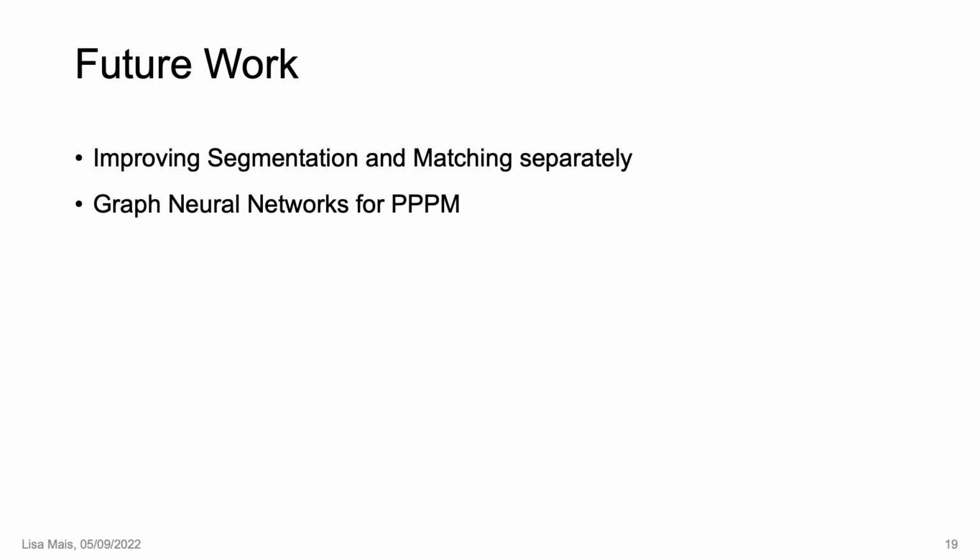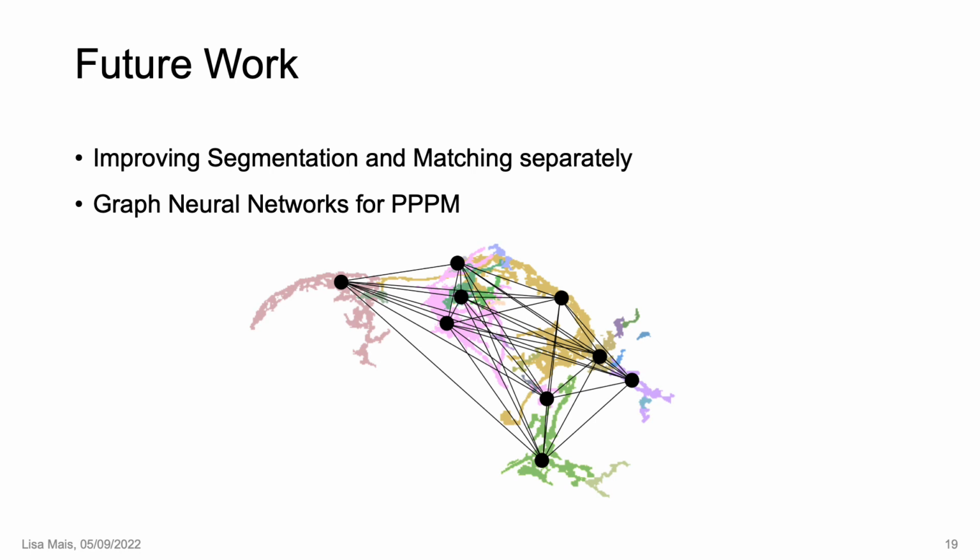In more detail, we want to use graph neural networks, where we construct a fully connected graph with the nodes representing the PatchPerPix fragments. And then we can use the NBLAST and coverage and color as node features, and as edge features we want to use the overlap, which means that different fragments may cover the same EM point, and this is represented in the overlap. And although we are in a very early stage of the project, we already get quite promising results.